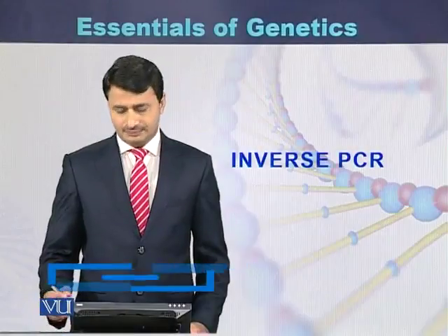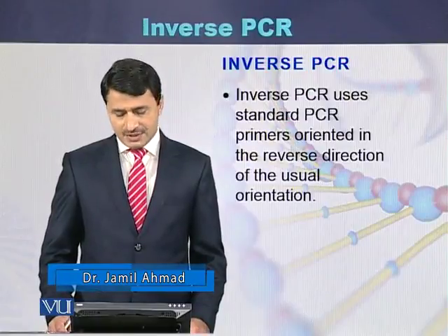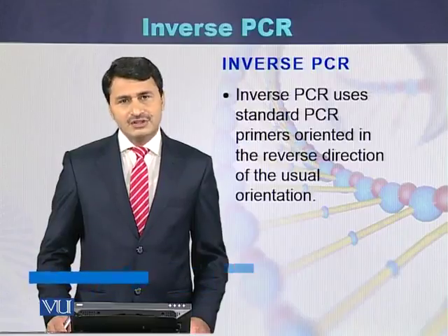Inverse PCR. Inverse PCR is a standard PCR in which the primers are oriented in reverse direction.